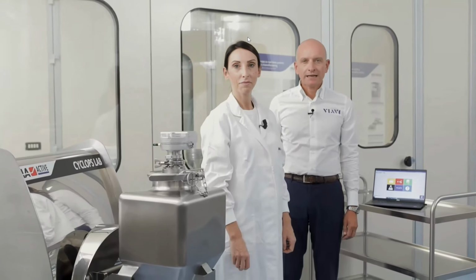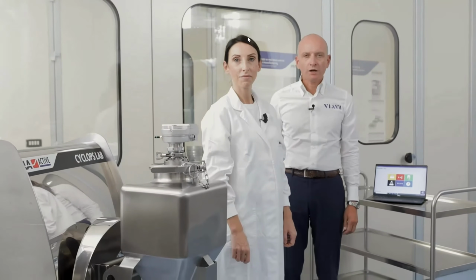because the traditional way to control a blending is prescribed by the ICH guideline. In this document, it's clearly written that you need to take 10 samples with a sample thief and bring them back to the laboratory where you will perform a UV-visible or an HPLC measurement. This is clearly not an online approach because the analysis has to be done only once the blender is stopped.